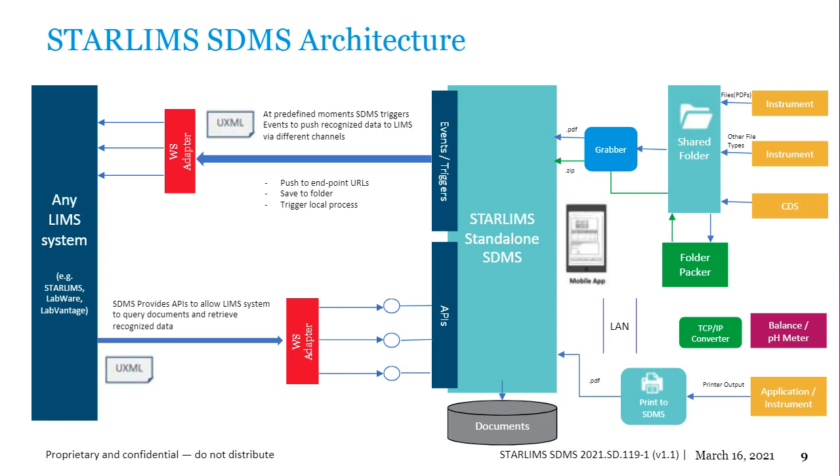So different types of endpoints, they're actually either SOAP-based or REST-based. Most of the SDMS services are SOAP-based, and this includes integration services, which are typically meant for the third-party LIMS systems, and designer services, which are probably more internal. While most of the operations are SOAP-based, there are quite a few that are REST-based, and typically those that are related to uploading and downloading the files. So if your LIMS system needed to extract some of those information or download some of those files from an SDMS, those APIs are available.